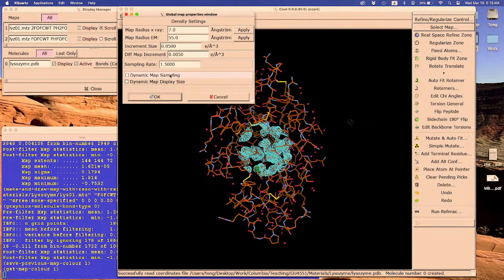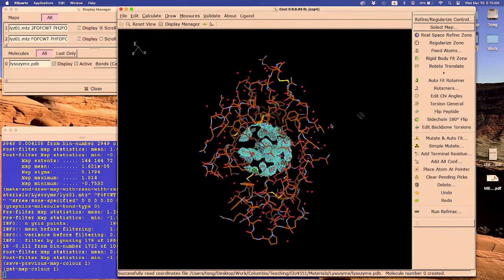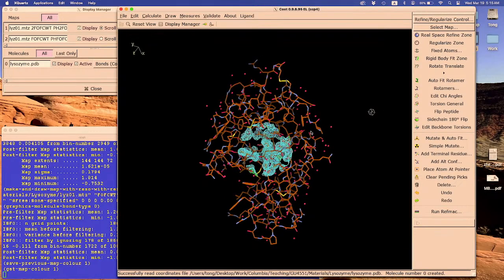Put in 7 or whatever number you like, and that will change it, and then say OK. Did that work? Yes. Good. All right, so everybody's on the same page now?